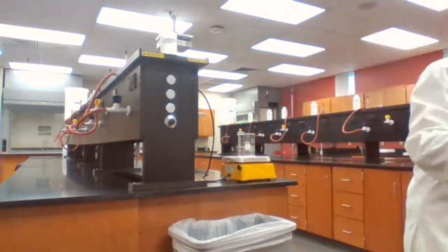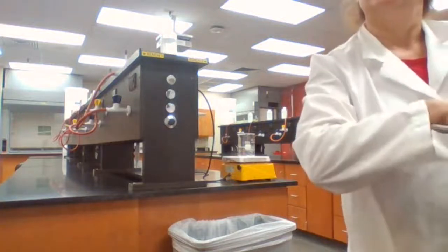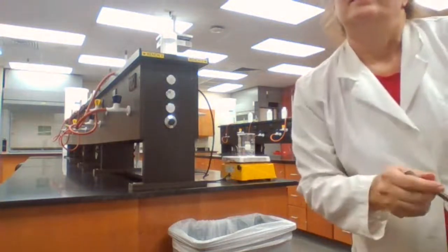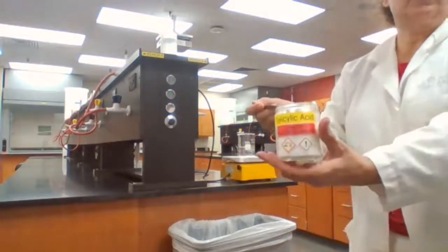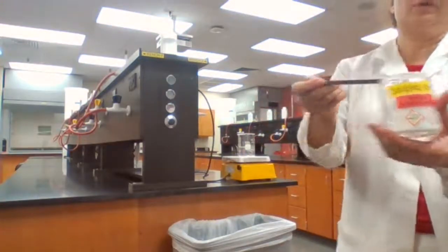Next step. 0.5 gram of salicylic acid. So I'm taking the salicylic acid and measuring 0.5 grams of it.